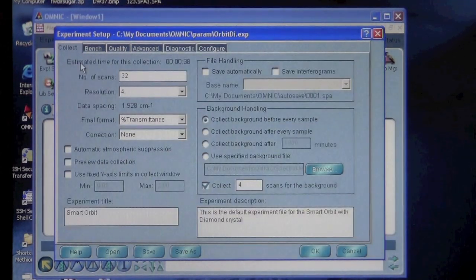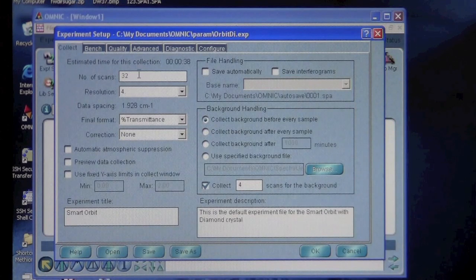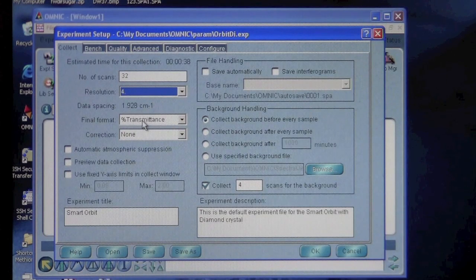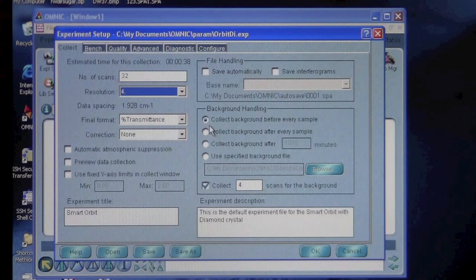Now you can go back to the Collect panel. On this tab are the settings for how we want to collect the data. You can set how many scans you want, the resolution, the format, other parameters down here, and also the background. Currently, it's set to collect a background before every sample.